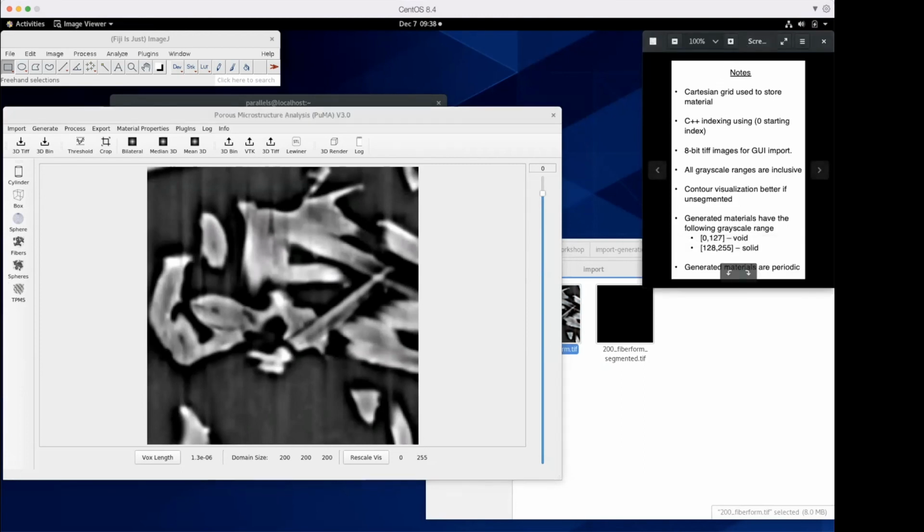Hi, Joseph. This is Ali. I just have a quick question. Sure. So about that last topic where you're talking about not using the segmentation because of this averaging of pixels and non-smoothness of surfaces, what about samples that you cannot really threshold easily?